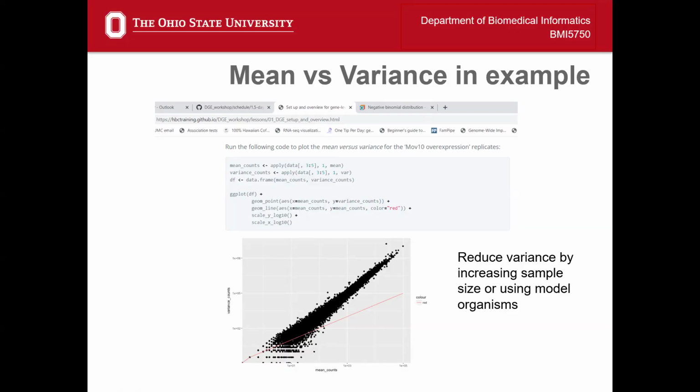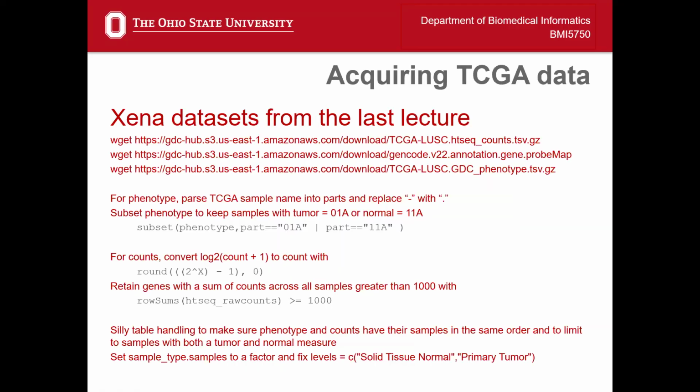We don't need to know how to do this by hand. It's all done within the differential expression package, but it's good to understand what the package is doing. Okay, so that builds us up to be able to understand what we're doing.